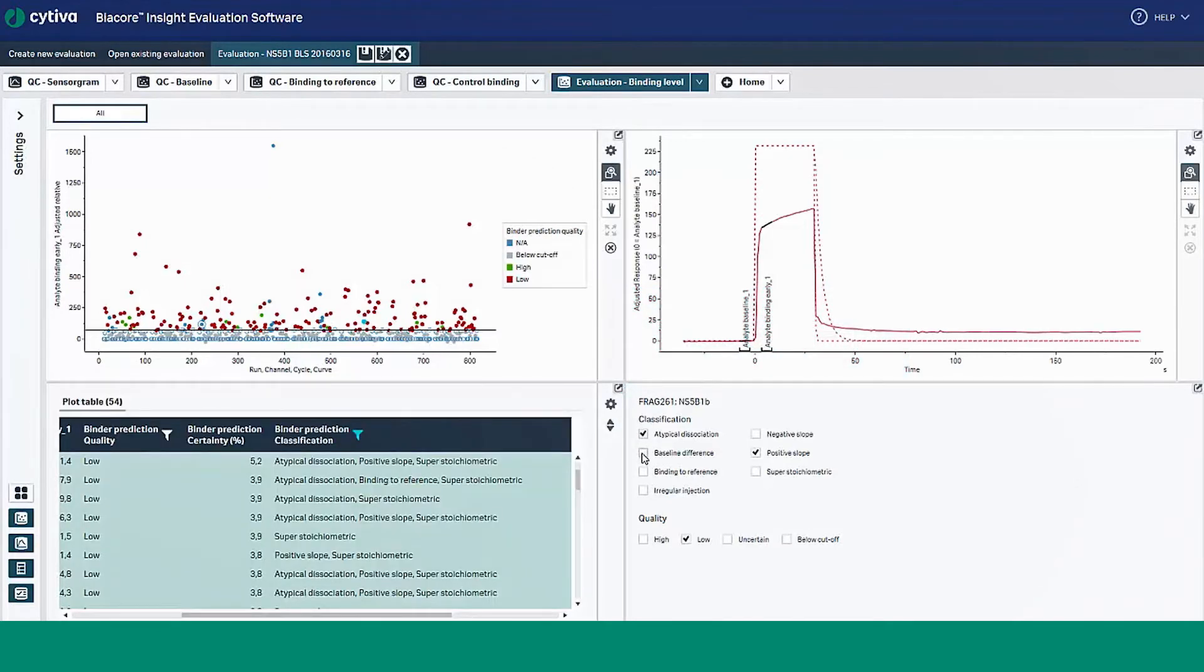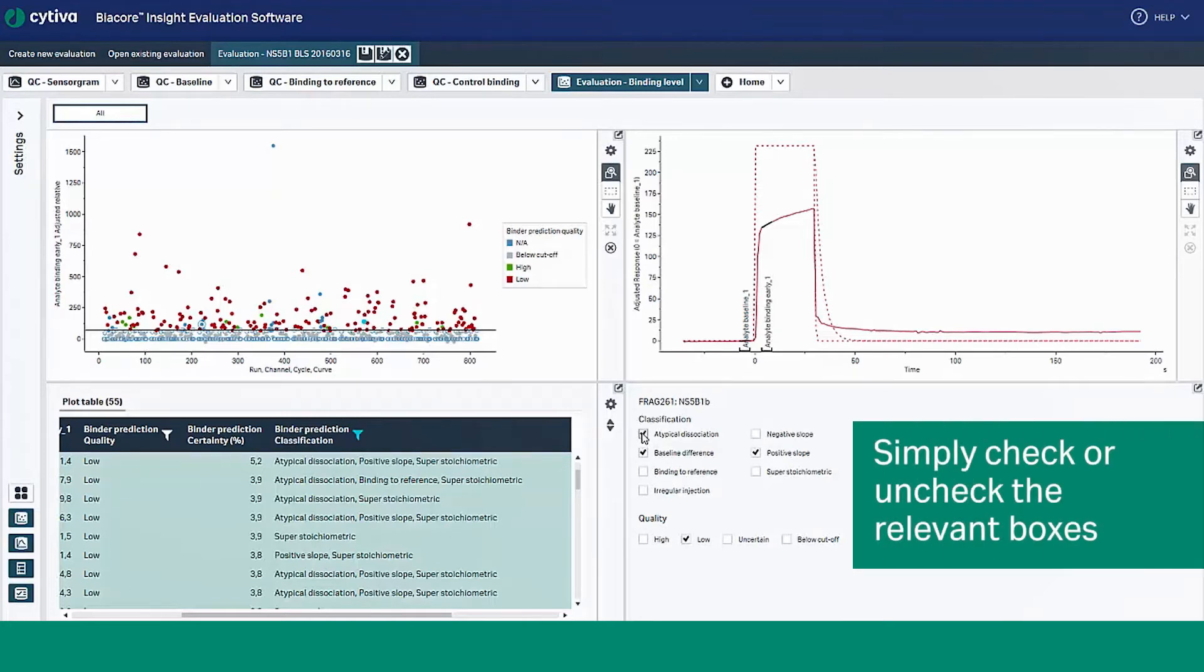You can override the model's prediction and replace it with your own interpretation of the data. Simply check or uncheck the relevant boxes for classification and quality.